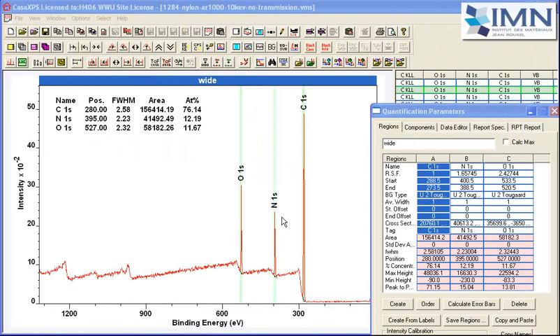It would be reasonable to ask the question, is XPS capable of understanding stoichiometry to the precision required here for nylon, where we're expecting 6 carbon, 1 oxygen, 1 nitrogen? And the answer is, in this particular case, yes. And the reason is that I've used Scofield cross sections that have been corrected for escape depth.